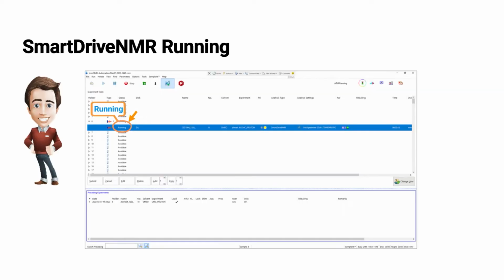Now, right after we kick off a SmartDrive measurement, our IconNMR automation window looks like this. On top, you can see the just running job, and on the bottom part of the automation window, you see the progress of the measurement. So it's right at the start, so the sample is just loaded. So we see the tick at load.